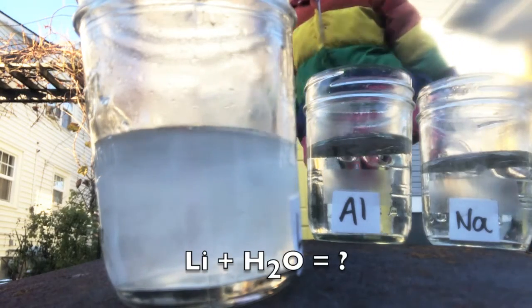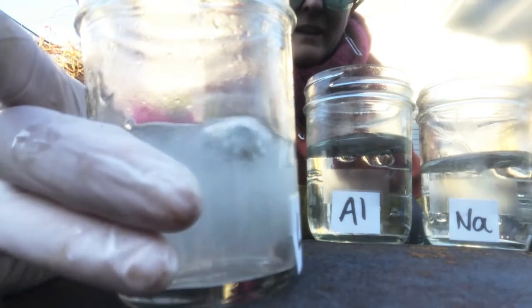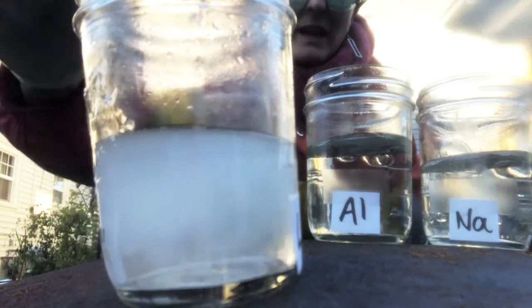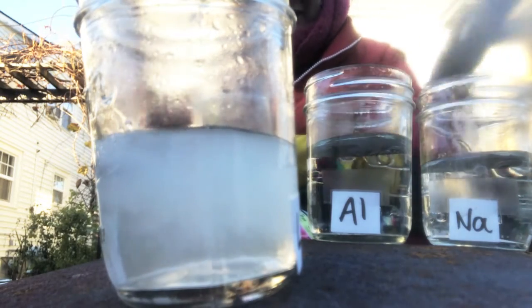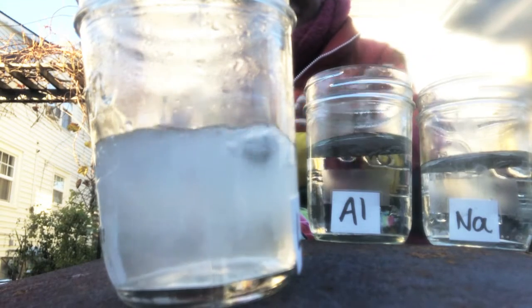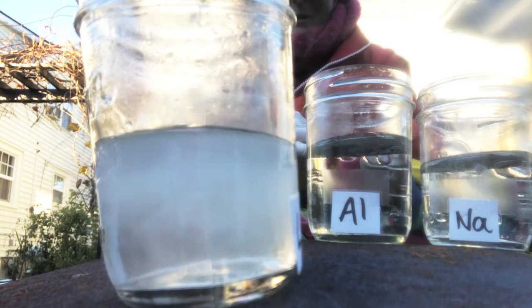So you've seen that the lithium is reacting with the water. It's bubbling. It's warm on the sides. It's producing a gas. That gas is not because all of a sudden I added heat to the jar. So it's not like the particles or the molecules are all of a sudden getting heated. They are getting heated because there is a reaction happening. So we'll talk more about that when we talk about chemical reactions.